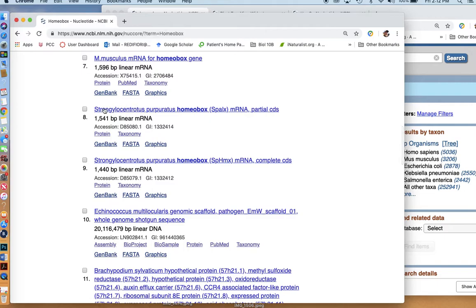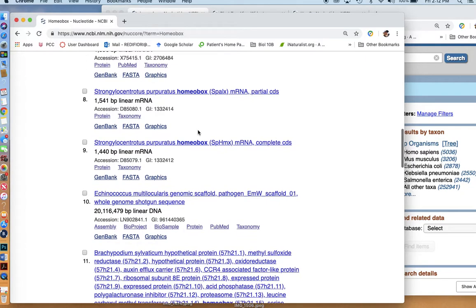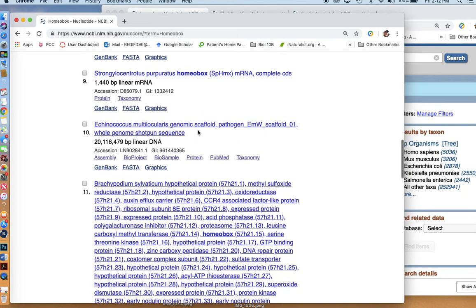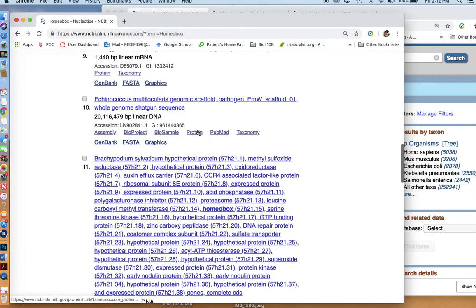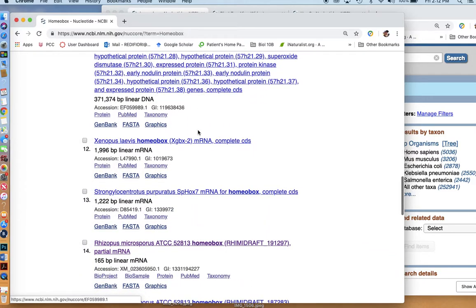So here's some Strongylocentrotus purpuratus. These are the purple sea urchins that you guys have been seeing in the intertidal. So that might be a good choice. And I kind of scroll down, looking through these possibilities.